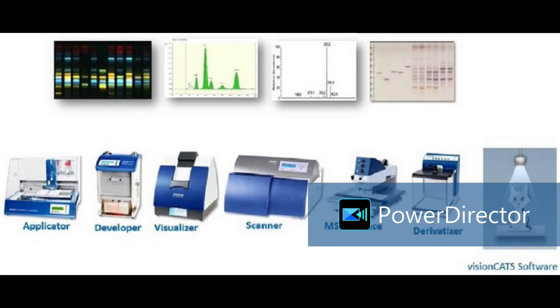But sometimes, if you feel that in 6 mm the separation is good and detection is good, more sensitive, we can select 6 mm band length. That is possible. Hit and trial. You need to keep experimenting. No, 8 mm is always fixed. For any forensic, food, herbal, any sample, we are using 8 mm fixed length.